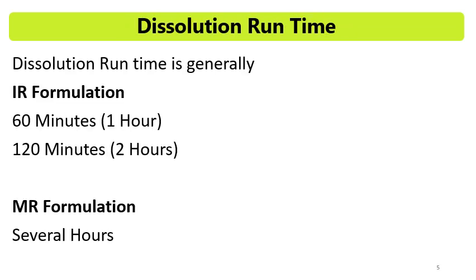Now, what is the dissolution run time? Always consider that the IR formulations are tested for around 1 hour. Some formulations are tested for 120 minutes, that is 2 hours, if these are having a profile or slow release, for the formulations which contain low soluble APIs, or if some solid dispersion technology is there, like higher polymer content, that time dissolution run may go up to 120 minutes also.